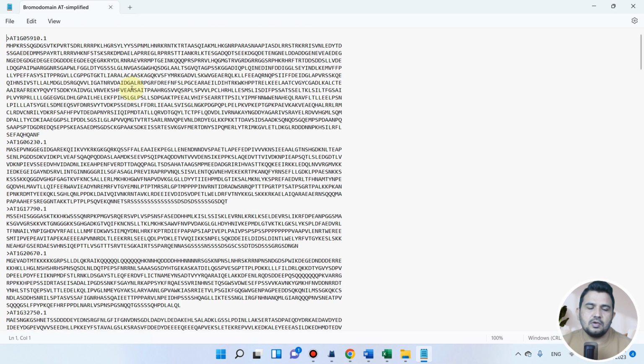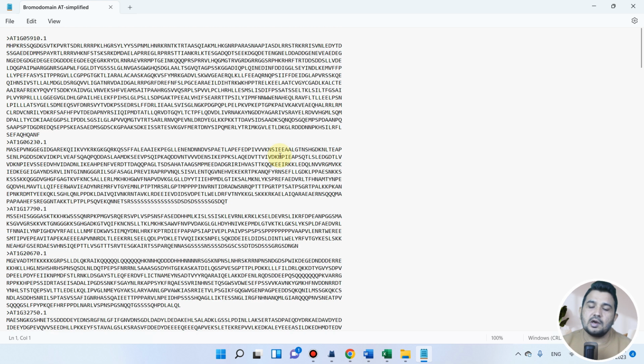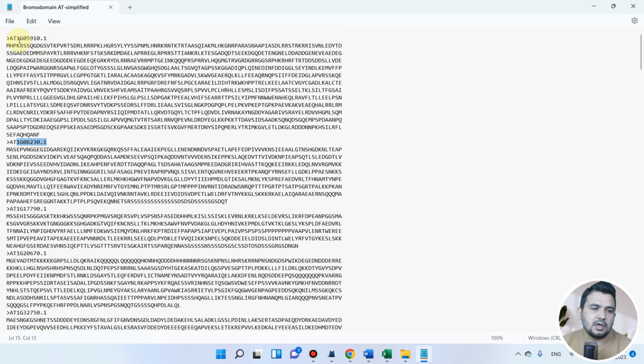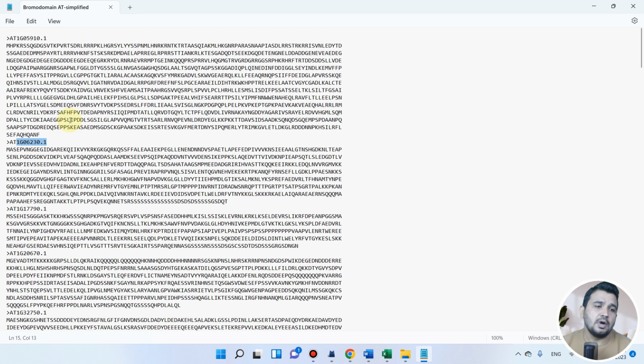As in this list, you can see now we have the simplified protein sequences. So we will be using this sequence list later on for our other videos and for later analysis. If you carefully notice, here the gene IDs are just simple gene IDs. It should be like Arabidopsis thaliana BRD1, BRD2, BRD3, because we have to name them in the sequence, but this part we will do in our later videos. So here our bromo domain genes from Arabidopsis thaliana are ready.